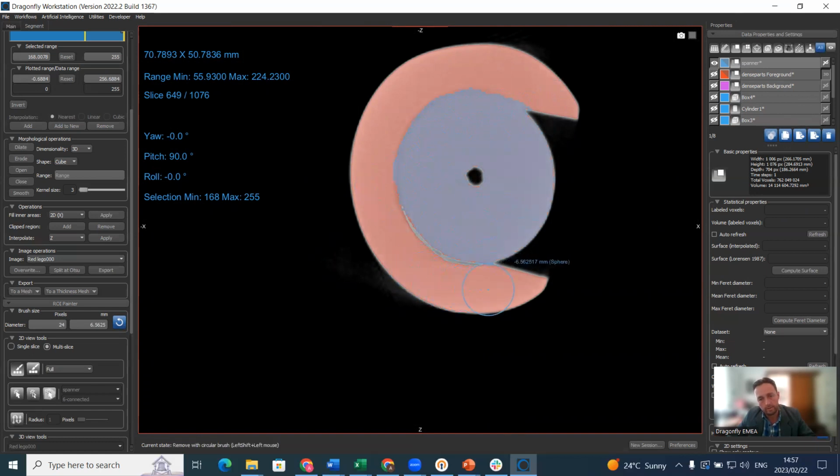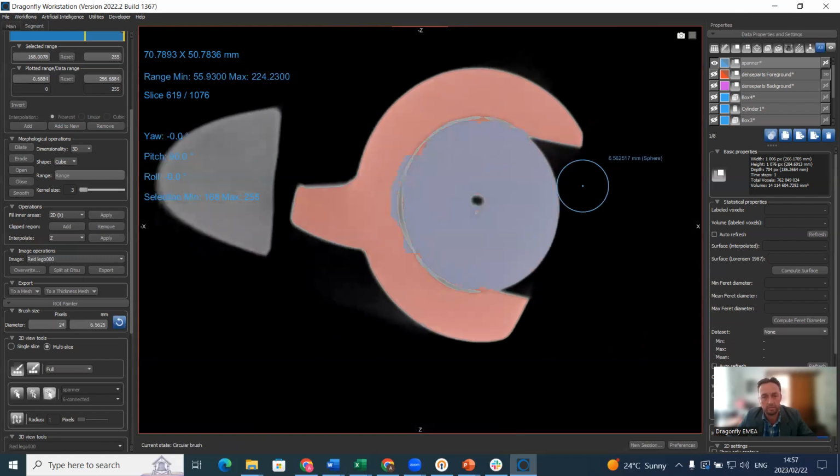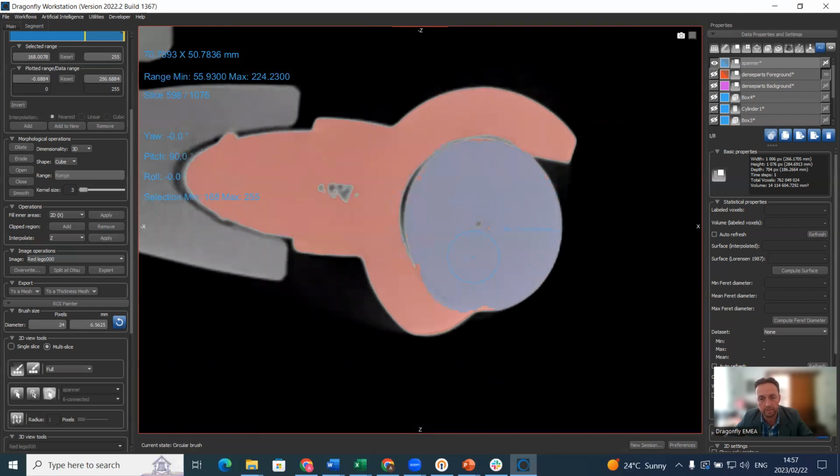So that's it really for manual segmentation. As you can see, it's possible, but it takes a bit of time. It's why we are actually interested in using deep learning methods or machine learning methods, which will be the next lessons. But for now, just get some practice with manual segmentation and do a segmentation of the spanner or any other part of the Lego man that you would like to have separated from the rest for a nice visualization.